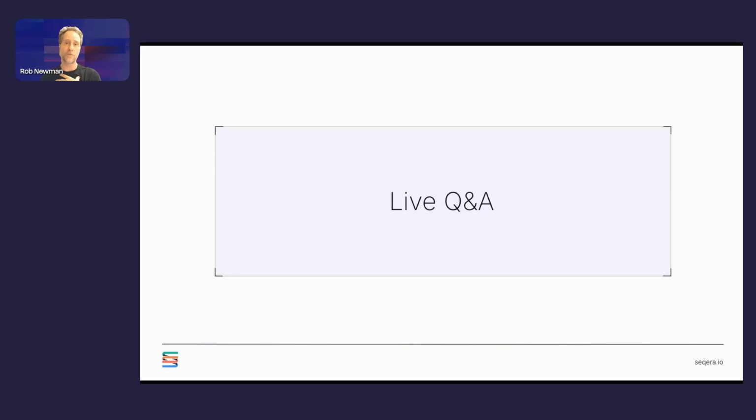The ones that we have heard directly from our customers are support for JSON and YAML, but we've also heard from customers about Parquet as a format that they would like to see supported in data sets. So please go ahead. You can use the search feature within feedback.seqera.io to filter down and see if another customer has already submitted the feature request that you want to submit. Otherwise, you can just go and upvote an existing one. And that goes for anything within Platform, anything related to Fusion, Wave, Seqera AI. We have different queues, I guess, for different parts of Seqera. So please vote early, vote often.